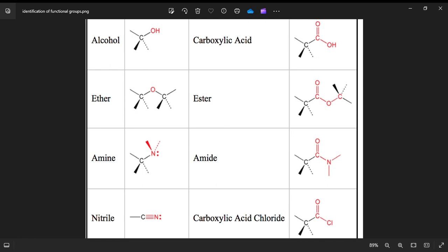Now, you can go through your manual very well. Another thing for phenols is that phenols do not liberate carbon dioxide from NaHCO3 solution, whereas your carboxylic acid will liberate carbon dioxide. There will be effervescence. So that will tell you, okay, this is carboxylic acid.